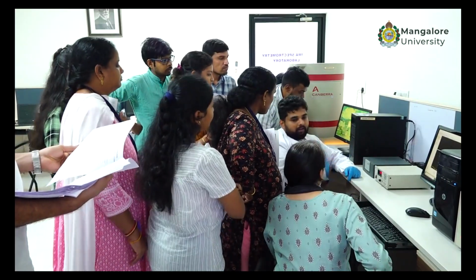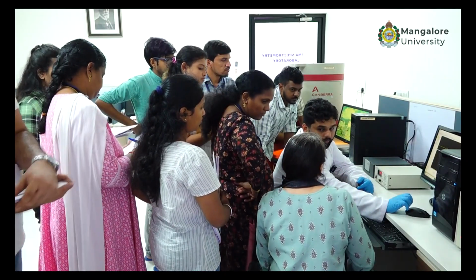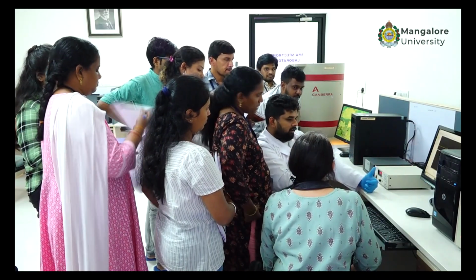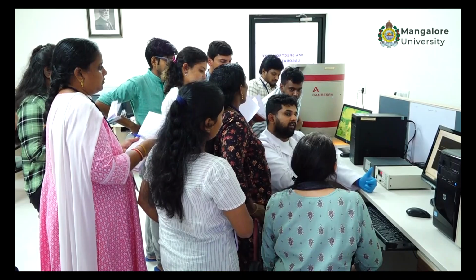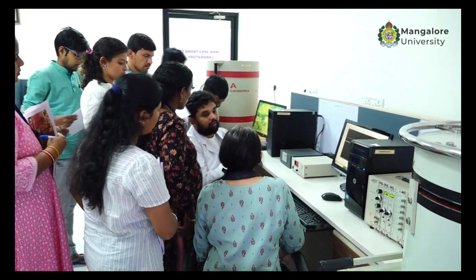Now we will start with the task for the day. In what cases do we go for the sodium iodide detector? If you want quick results, if you want only identification. For example, if you want to find out what is there, to check quickly if there is cobalt, if there is cesium.